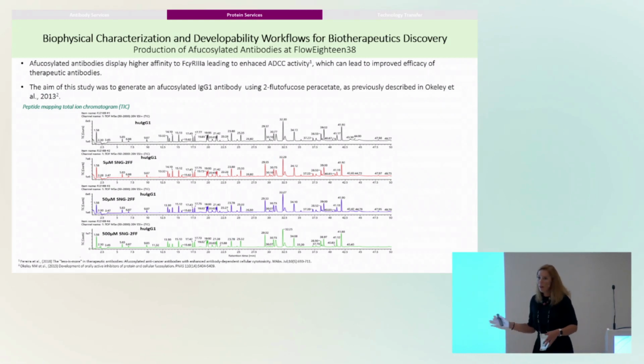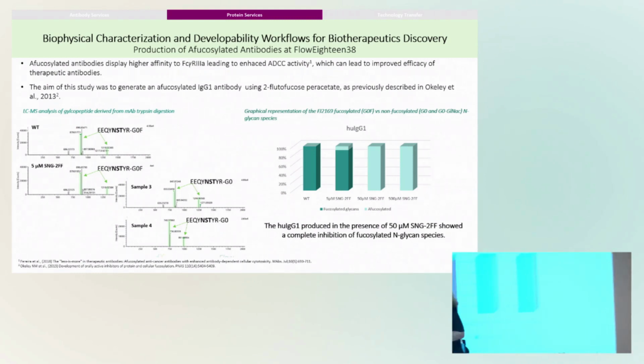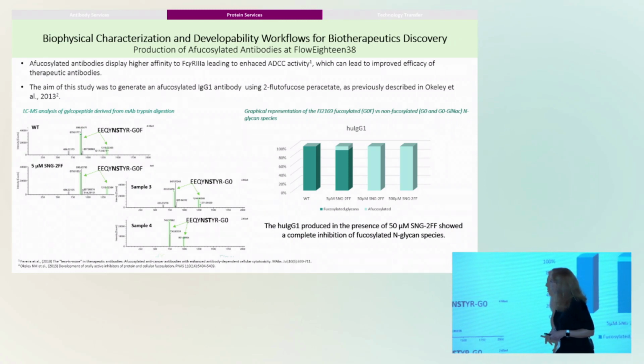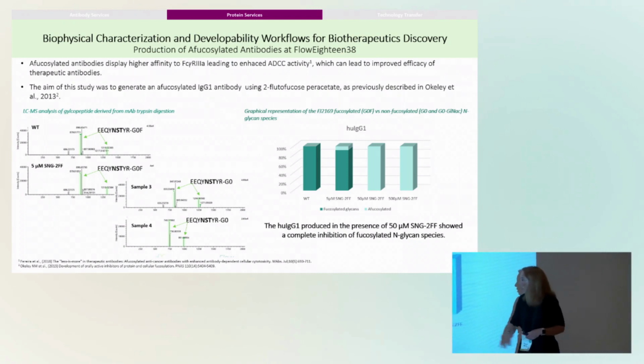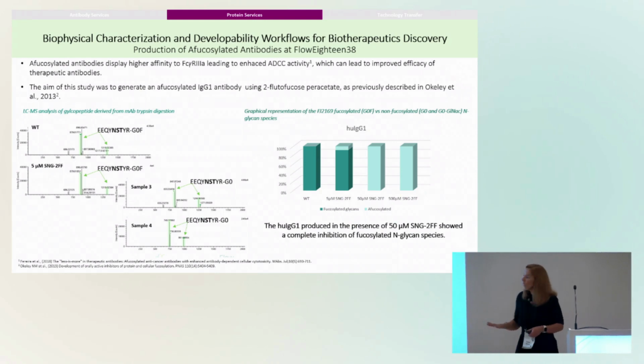So this is the peptide mapping. I do not expect you to find any difference here, okay? This was just an illustration. But I wanted to try to show you there is a shift. It's a very small mass, so it's difficult to spot graphically. It's very well done by the software. Again, I don't expect you to see the numbers, but there is a shift from here to here. This is mass to charge, so we're talking about very, very small masses. And we were able, for all conditions above 50 micromolar of this reagent, to completely abolish fucosylation. I haven't shown the data here, but there was no impact on yields or cell viability.